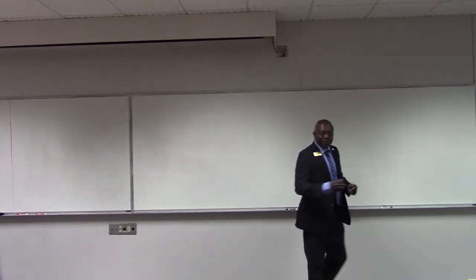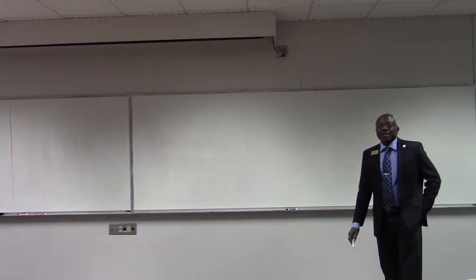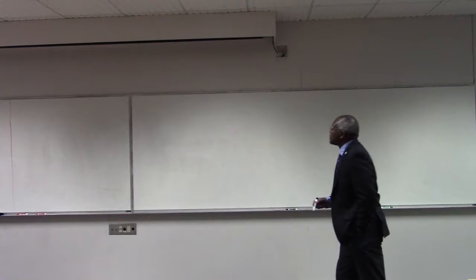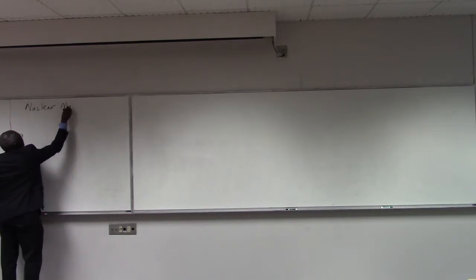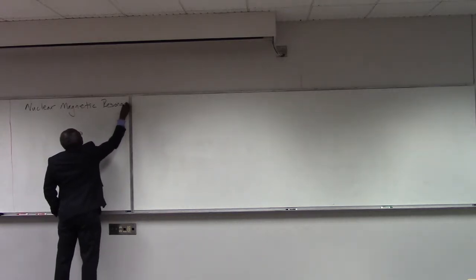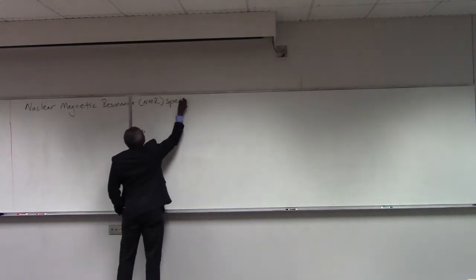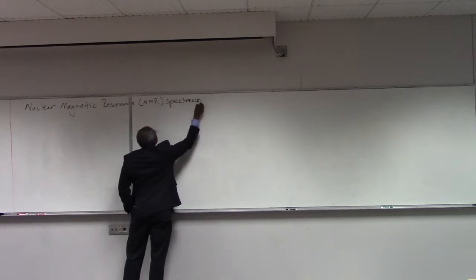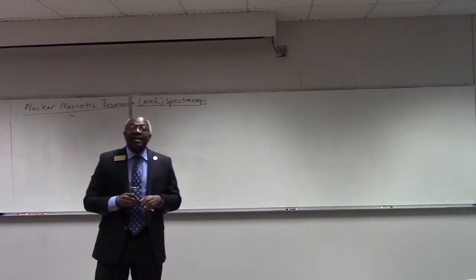Okay, so, thank you. So we're going to start a couple of lectures on nuclear magnetic resonance spectroscopy. So this is NMR. So we're looking at nuclear magnetic resonance, or NMR spectroscopy. And this is really one of the workhorse techniques in organic chemistry.